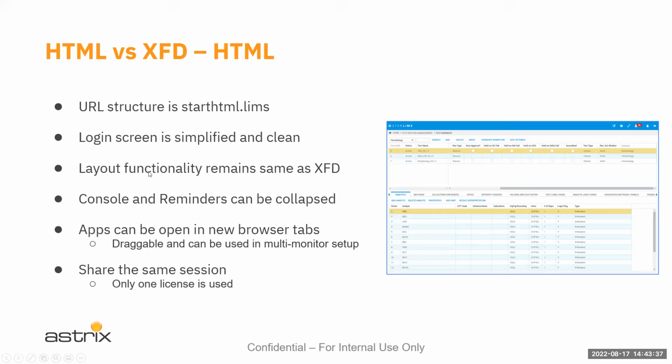So yeah, this is what I'm saying here. The layout remains the same as XFD because it was a conversion. It wasn't a brand new app that was written. It was just existing being converted. And then there's the console and the dashboard. There were some enhancements made there. You have breadcrumbs. You can collapse them. You can do some, let's say, UI, UX that weren't there before on XFD.